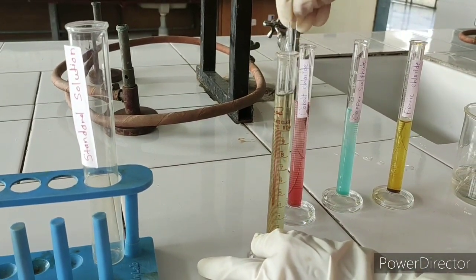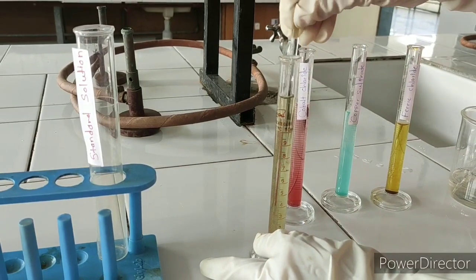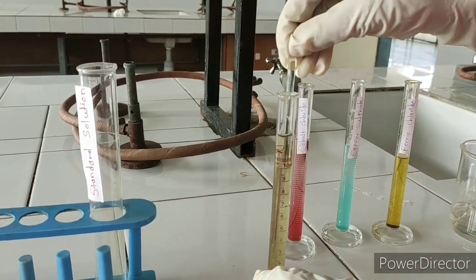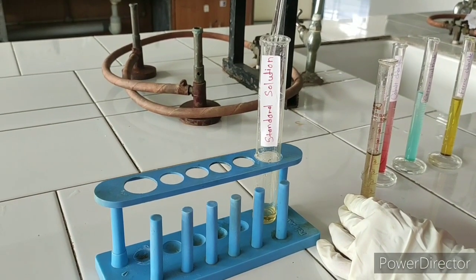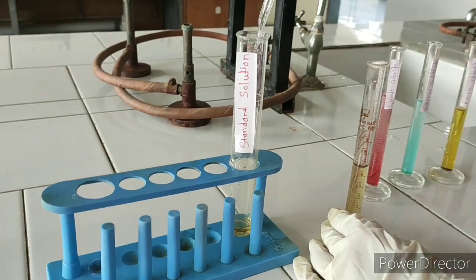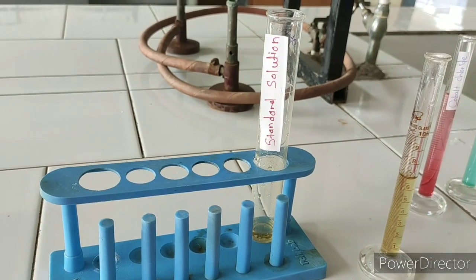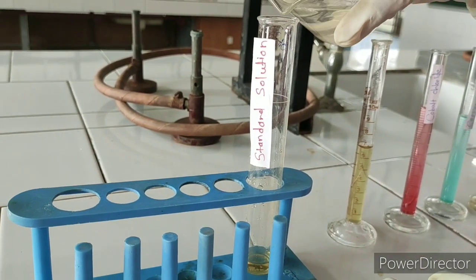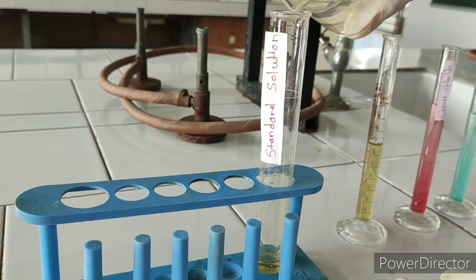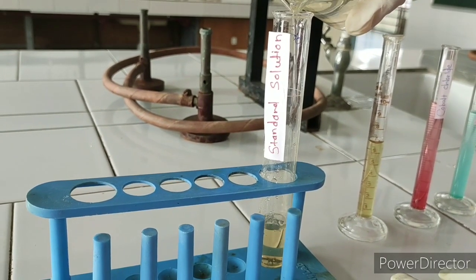Stir it well to mix the solution and water. Now take 3 ml of solution from the stock solution of 10 ml and add purified water to make the volume up to 50 ml.